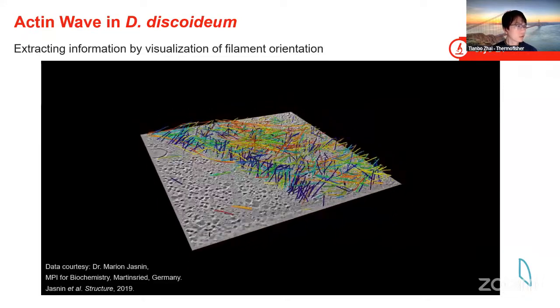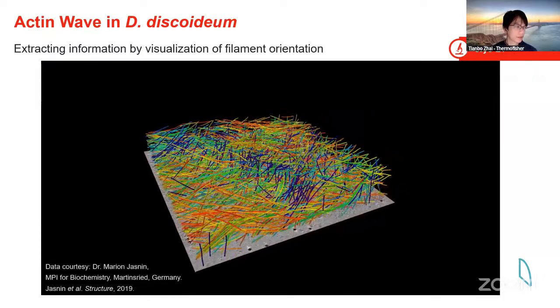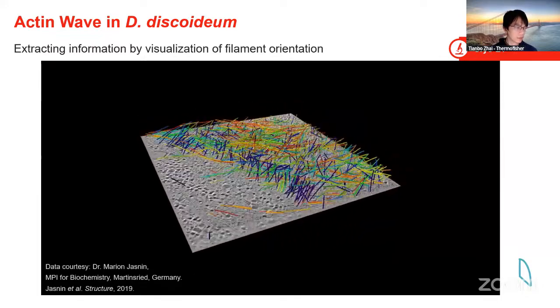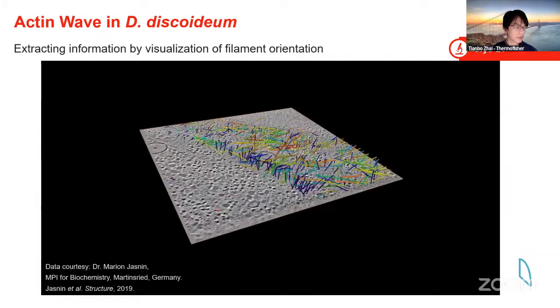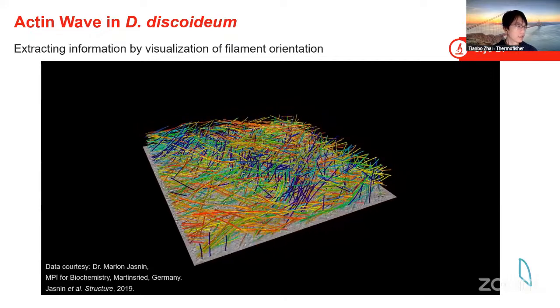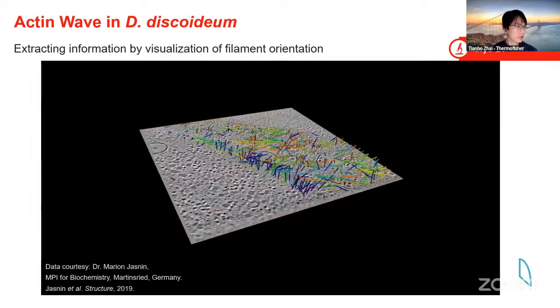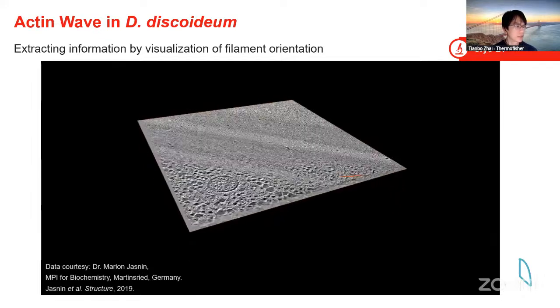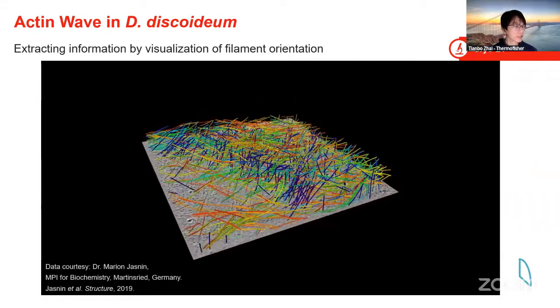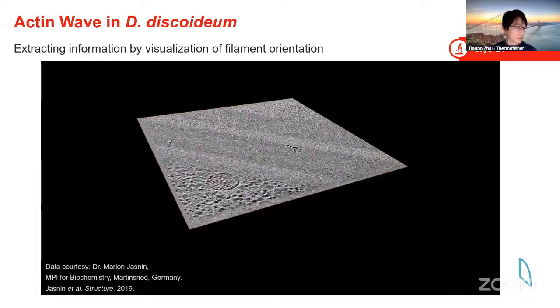And this is one of those quantification parameters available to use: after you segment the structure of interest, which is those cylindrical filament-looking structures, we are able to take a measurement, because right now everything is segmented as separated as possible, so that the measurement can be applied to individual filament-looking structures.